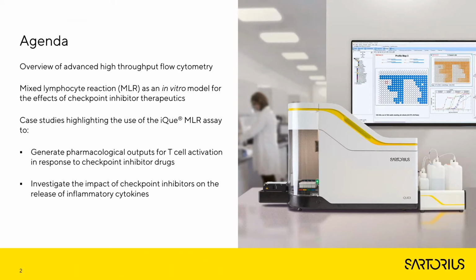I'll then give an overview of the mixed lymphocyte reaction and how it can be used as an in vitro model to measure the effects of checkpoint inhibitor drugs. Finally, I'll cover two case studies that will exemplify the uses of the iQue MLR workflow. The first case study will look at quantifying T-cell activation response to checkpoint inhibitors, and then the second case study will look at the effects of checkpoint inhibitors on inflammation.